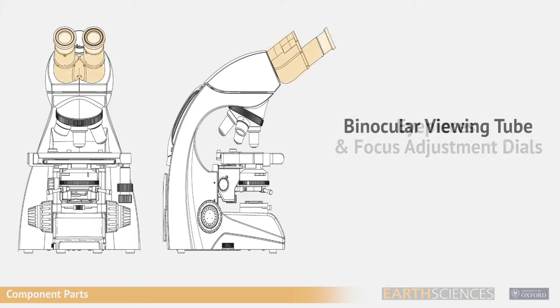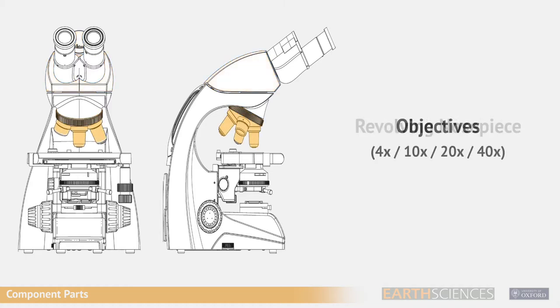The parts of the microscope are as follows: eyepieces and focus adjustment dials, binocular viewing tube, head, revolving nose piece, and objectives.